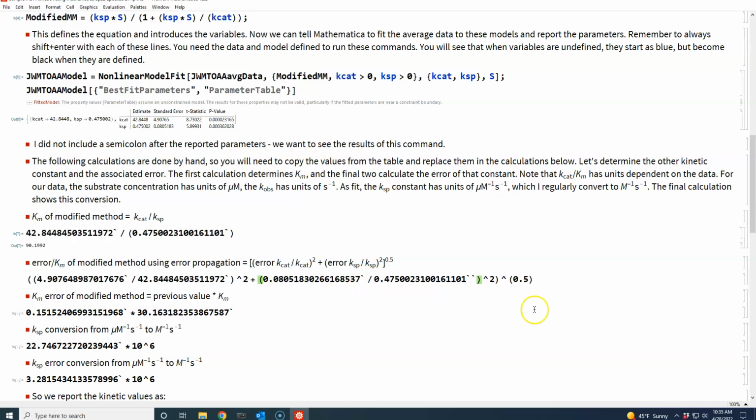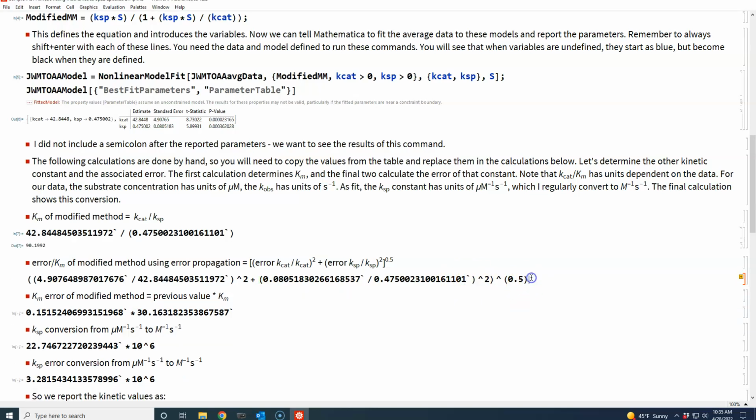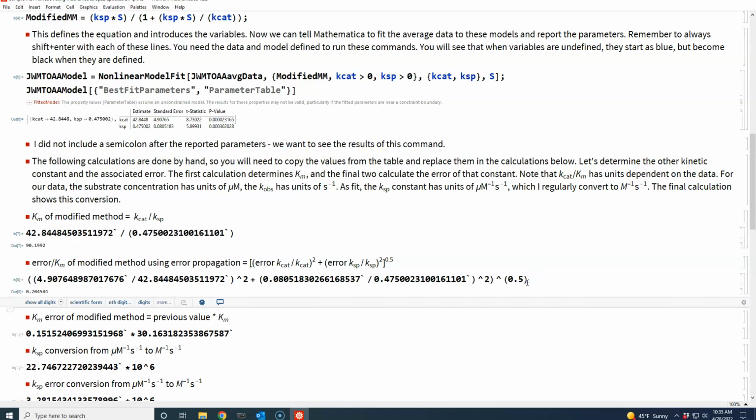And now I want to do Shift Enter here to get my output. Okay, so that's my... I don't actually see it. You got another double apostrophe. Oh, okay, so if I get rid of that, and then I can try it again, Shift Enter, there's my output.